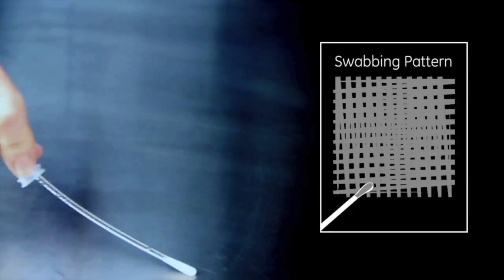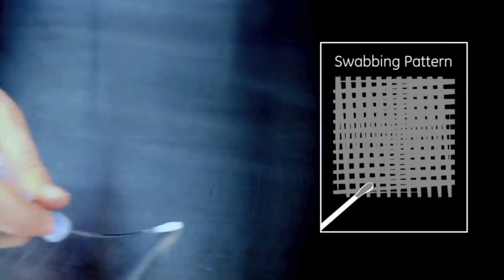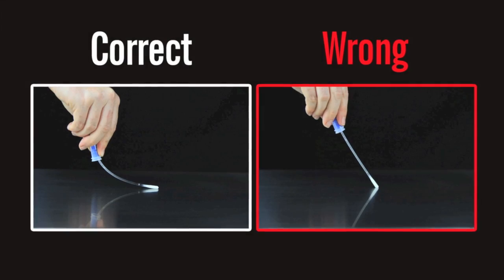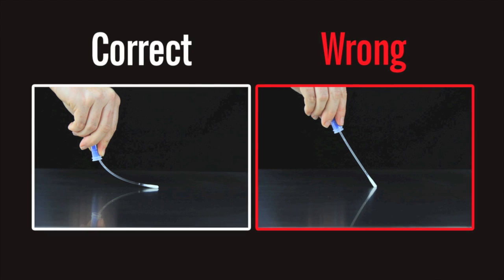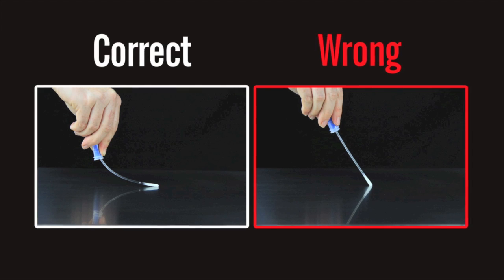Swab a 4x4 inch square area in a criss-cross pattern, swabbing the area with even coverage. Apply sufficient pressure to create flex in the swab shaft. This maximizes sample collection and improves accuracy of test results.